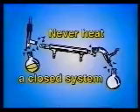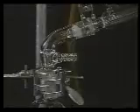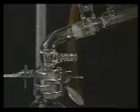Have a look at the vacuum adapter sidearm. If it has an opening to allow pressure to equalize, then the question has been answered. This is not a sealed system and not a bomb. Start your distillation by adjusting the water flow through the condenser to a modest flow rate. No benefit is gained from a fast flow, as the increased pressure in the apparatus may cause a piece of rubber tubing to pop off and cause an unexpected bath. It is good practice to clamp the hoses to the condenser and to the water faucet.